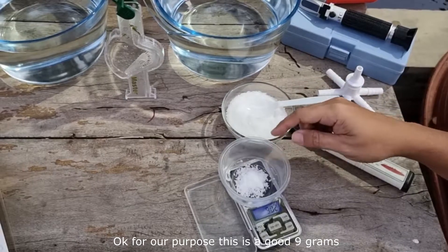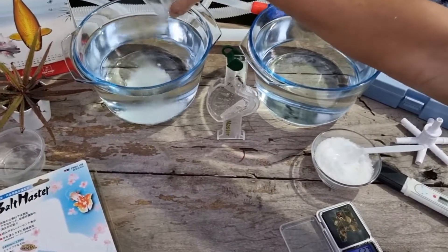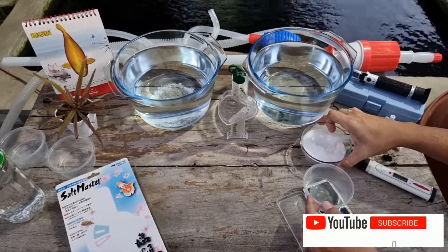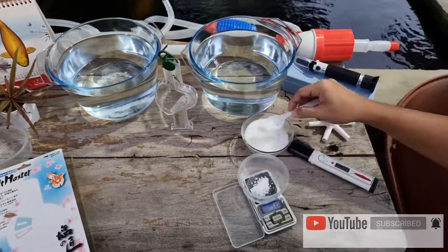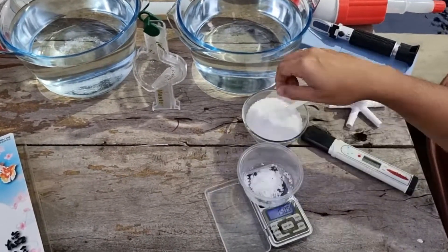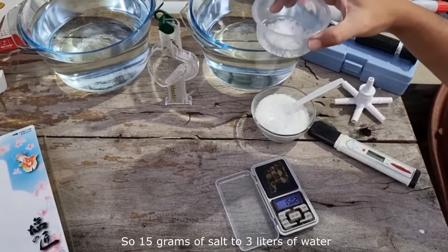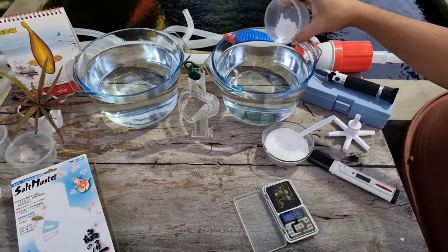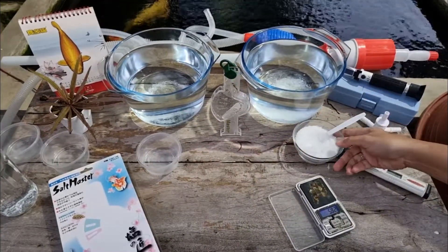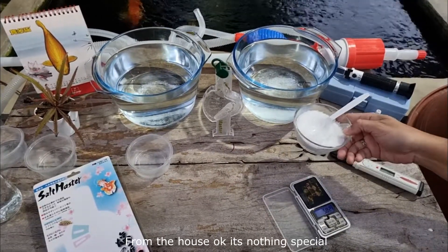So 9 grams goes into our first bowl for the 3ppt solution. And 15 grams of salt goes into the second bowl for the 5ppt solution. By the way, the salt I'm using is just common table salt from the house — nothing special.